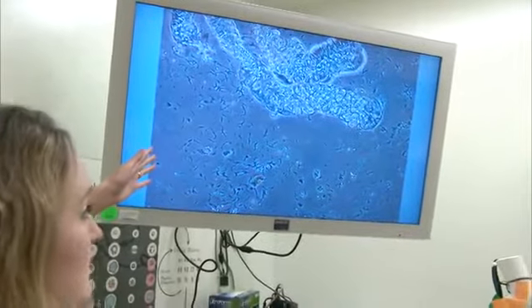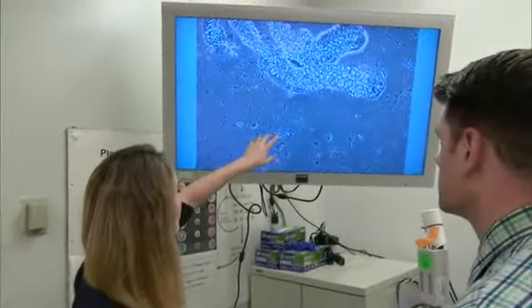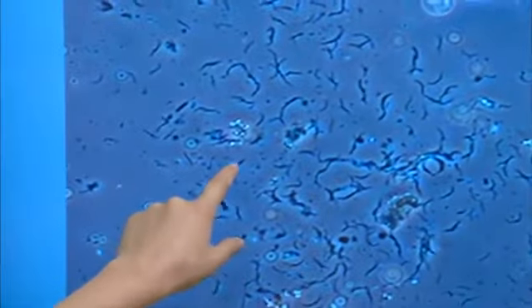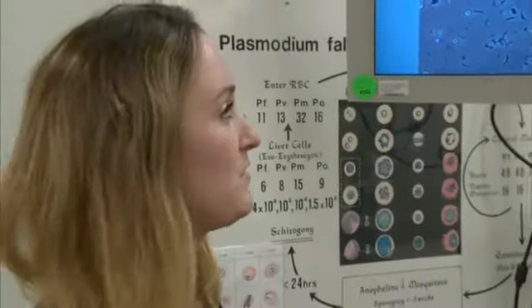Now, obviously, these were just mock mosquitoes, so your salivary glands are not infected. But I do have a sample of salivary glands with sporozoites that we can go ahead and take a look at. Great, let's take a look at it. All right. This is what you would see if the mosquitoes were infected. You see these little tiny sporozoite parasites, the infective stage, and they kind of look like tiny eyelashes. So we have a pretty good number right here on the screen. So if this was a real challenge, we would be happy with what we see.